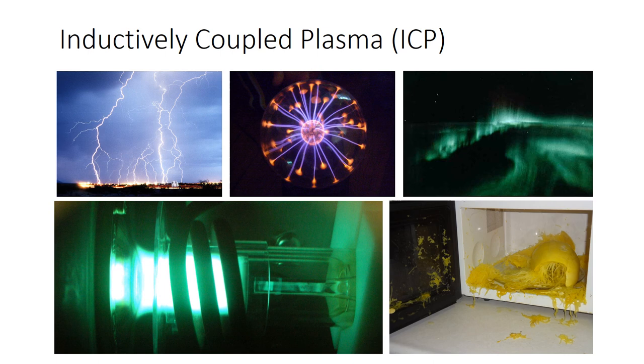Okay, so moving on to another type of ionization. This is plasma ionization, so quite often called ICP or inductively coupled plasma ionization. Plasma is kind of like a fourth state of matter, a fluid or a gas that, rather than being of atoms or molecules, is a mixture of ions and electrons. It's quite a high energy state, because you need a lot of energy to maintain this mixture of ions, which would usually want to combine and neutralize each other.